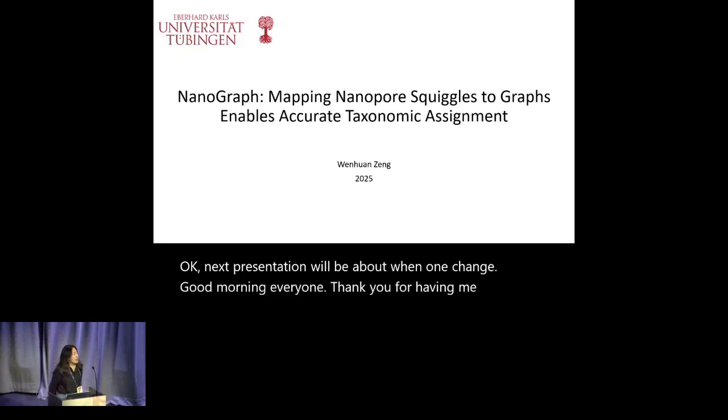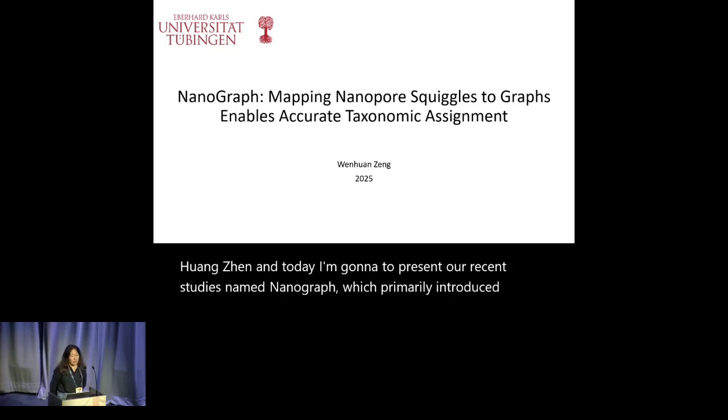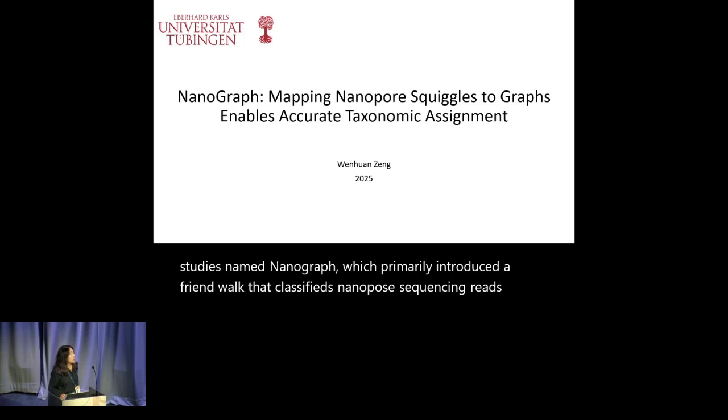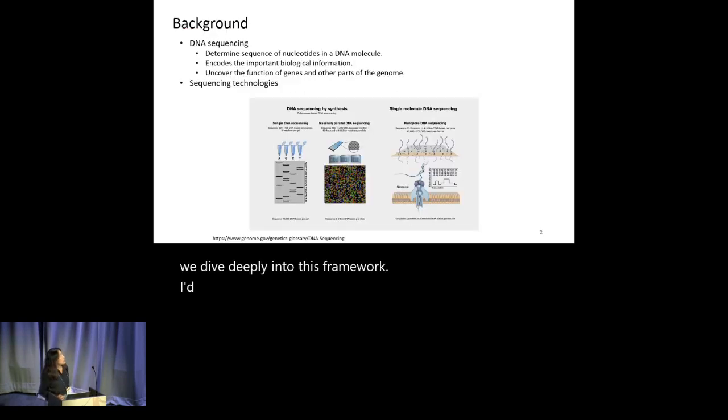I'm Wenhuan Zeng, and today I'm going to present our recent study named NanoGraph, which primarily introduces a framework that classifies nanopore sequencing reads directly from its raw signals using deep learning approaches. Before we dive deeply into this framework, I'd like to give some introduction to the background.